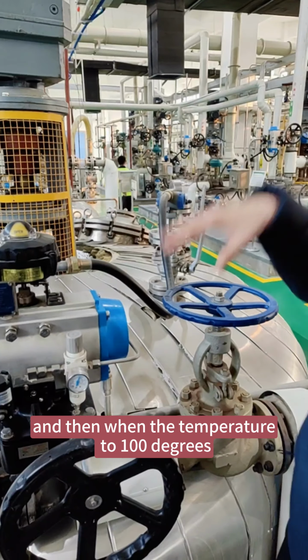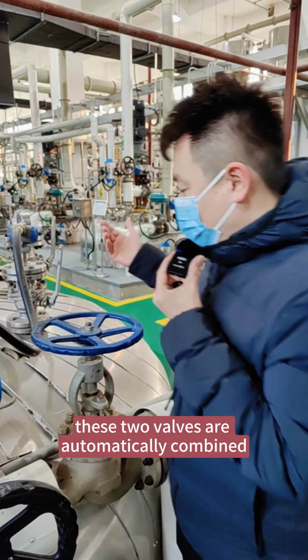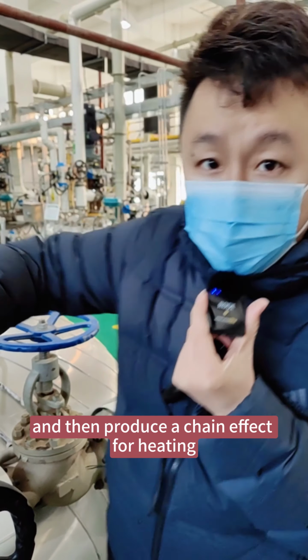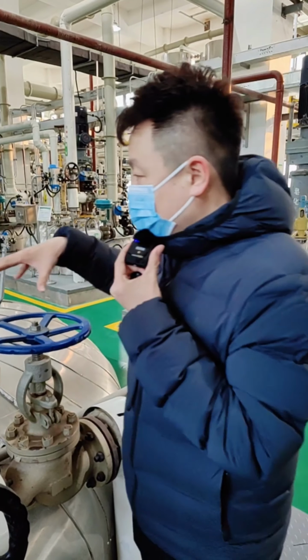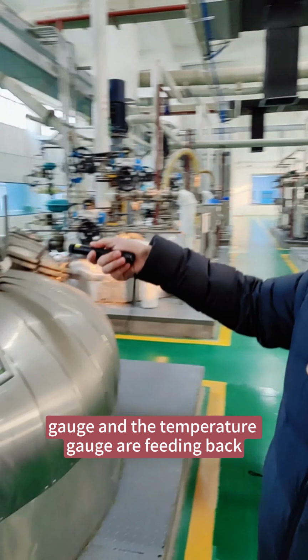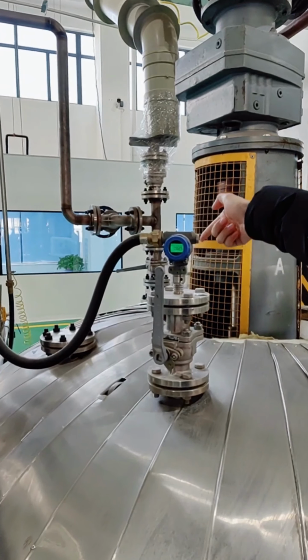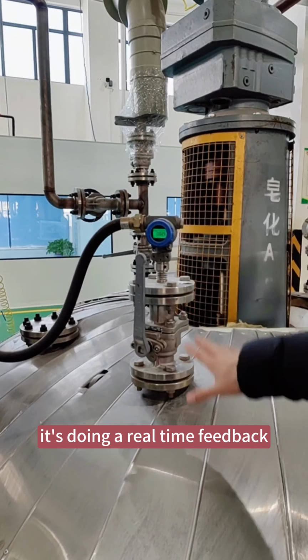process. And then when the temperature reaches 100 degrees, these two valves are automatically combined and produce a chain effect for heating. And now the mixing is running automatically, and the pressure gauge and the temperature gauge are feeding back. This is our pressure. It's doing real-time feedback.